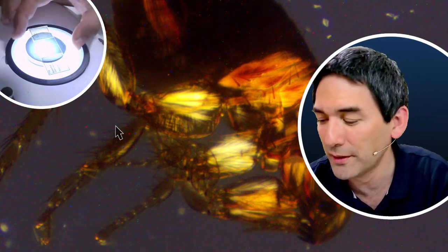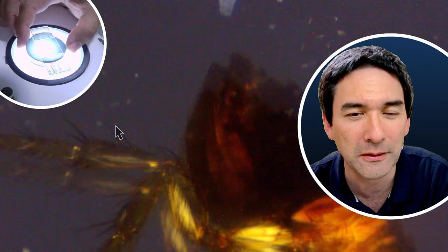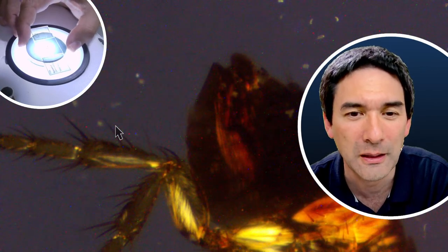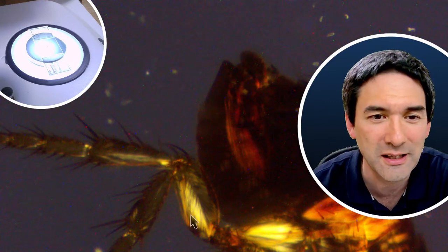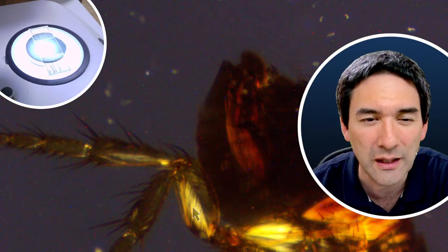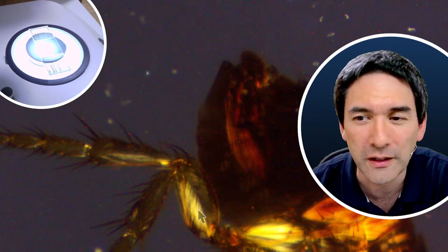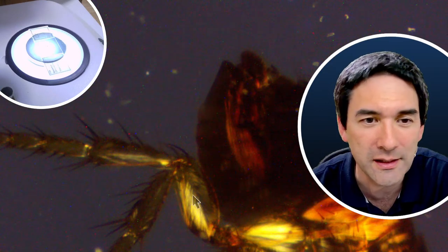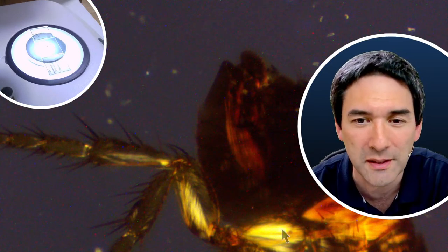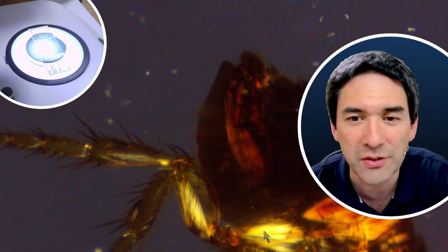the other parts of the dog flea, the abdomen, for example, here, it's pretty dark, but where you see here, you can also see it quite nicely. You can see the individual horizontal lines here, the individual muscles of the dog flea. So I really like this. This was a little bit of a surprise to me myself, that using polarized light you're able to see this well.